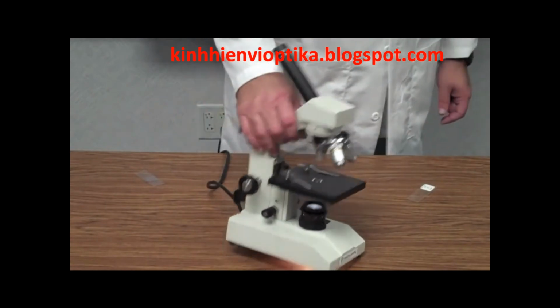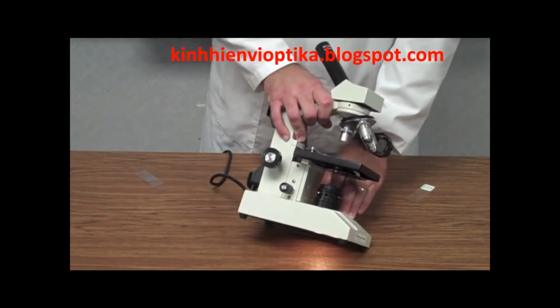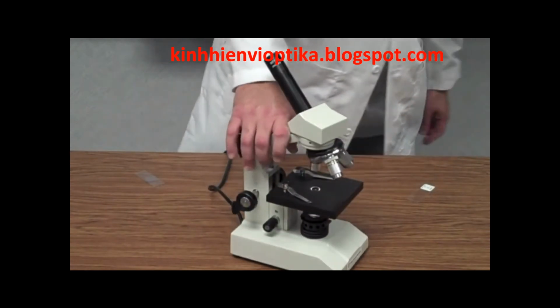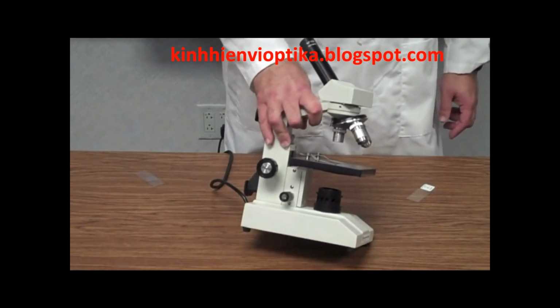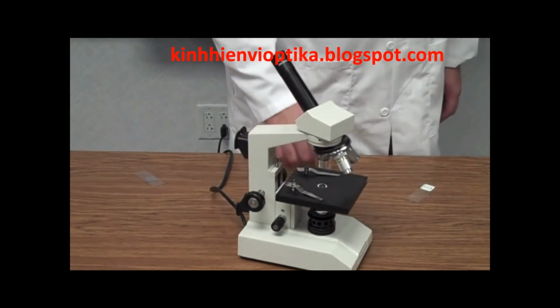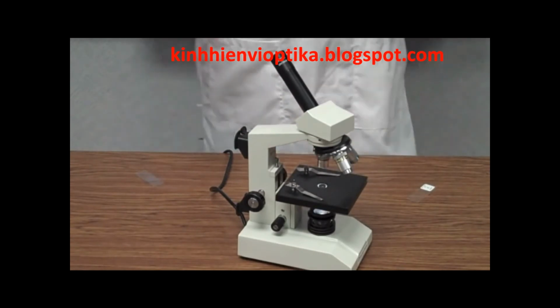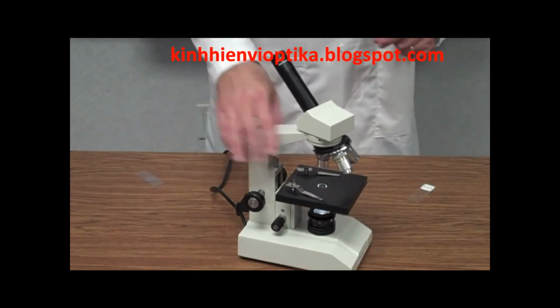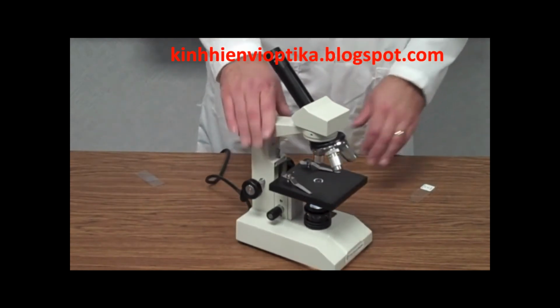Okay? Then we want to make sure that our light source is on. Okay? You would not believe how many times I get the comment, "Mr. Wilhelm, I can't see anything." And I say, "Well, is your light on?" "Oh, no." Turn the light on. You cannot see anything unless the light is on. It's a compound light microscope. You have to have a light in order for this microscope to work. Okay? So make sure your light's on.